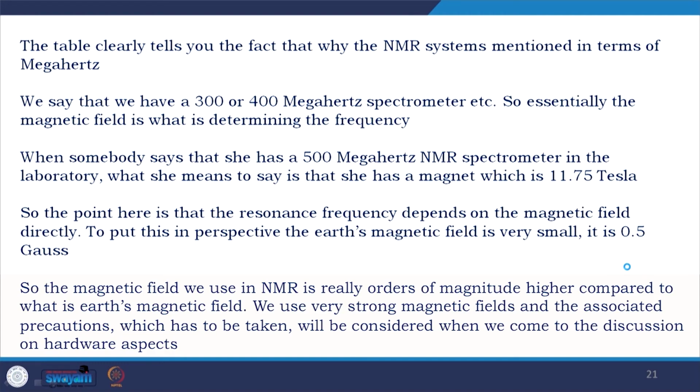So, the magnetic field we use in NMR is orders of magnitude higher than the earth's magnetic field. We use very strong magnetic fields, and the associated precautions which have to be taken will be considered when we discuss the hardware aspect.